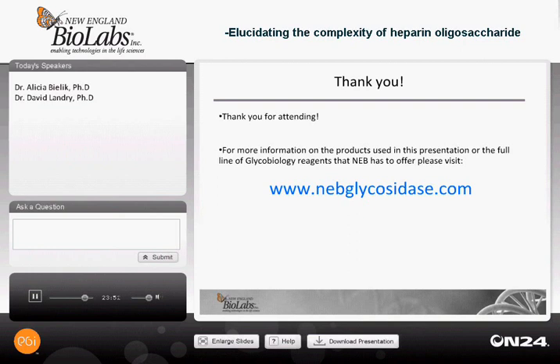The first question I have here is, have you tried other types of HILIC columns? The answer would be that we have only tried the Amide 80, but we've tried several brands, and they all seem to work pretty well. Second question is, do heparinases work on mammalian cells? Yes.